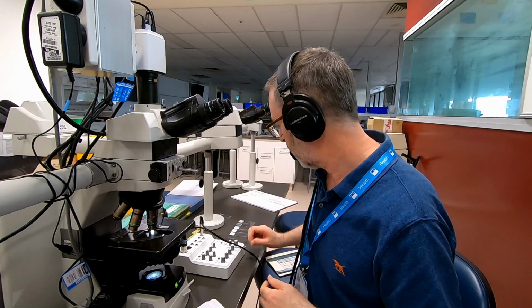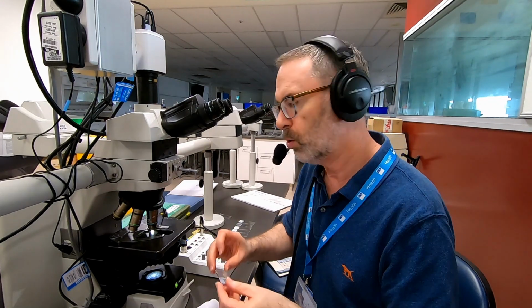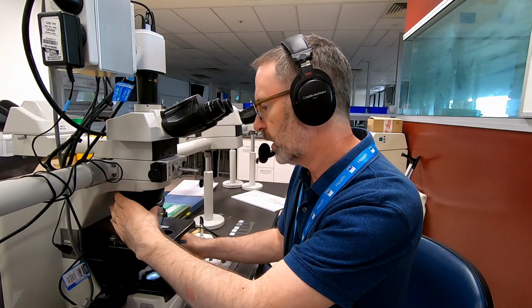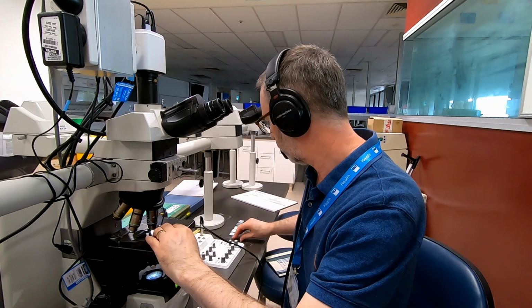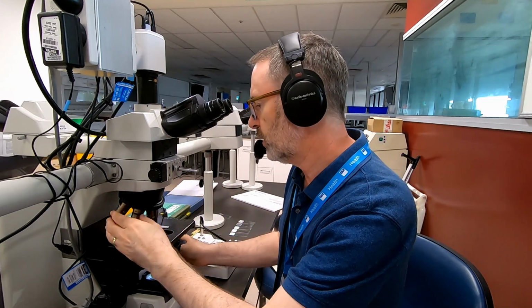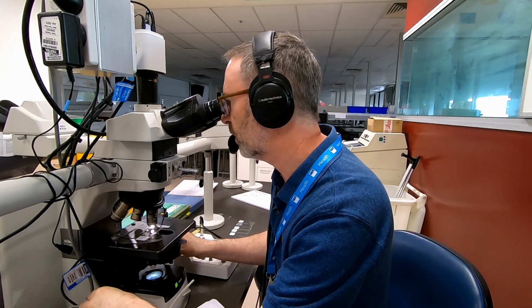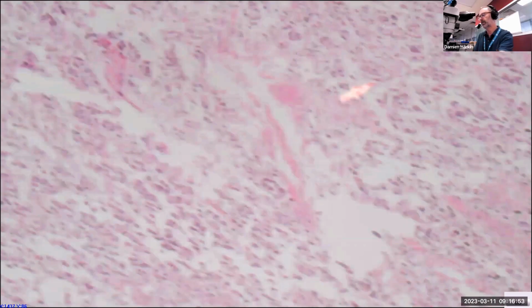Okay, so let's begin with a stain reaction called Schmorl's. And Schmorl's is the one that we did look at very briefly last week. In fact, I'll just go back to the previous slide, the H&E non-bleached slide, and I'll intentionally come down to an area here, if I can just find it.